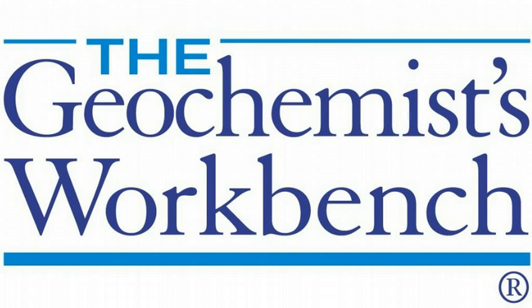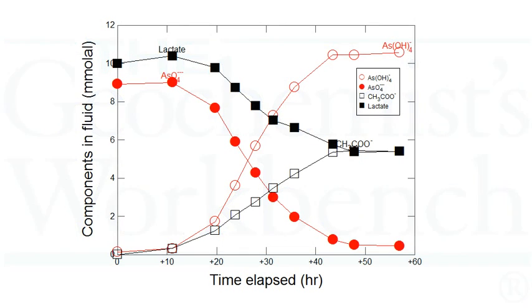Hi, this is Brian Farrell with Aqueous Solutions, LLC, makers of the Geochemist Workbench. Today I'll show you how to create an XY plot using the data in your GSS spreadsheets.